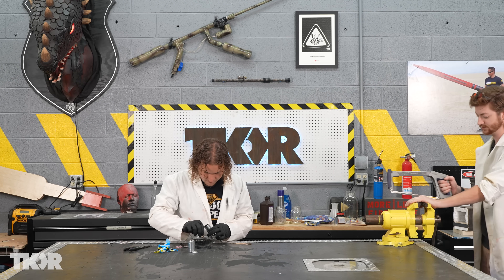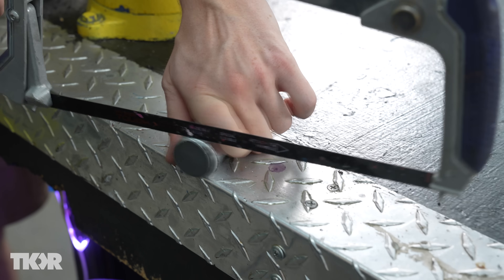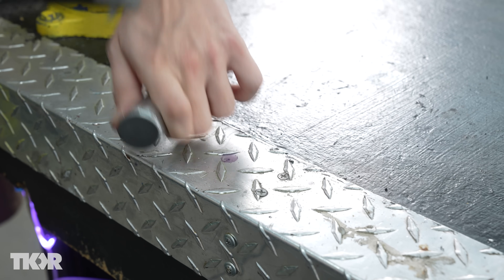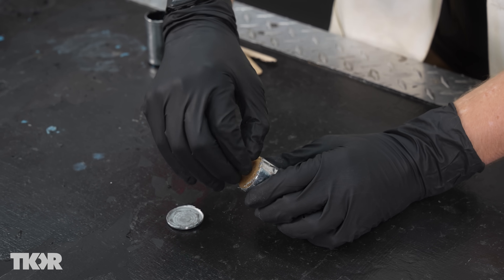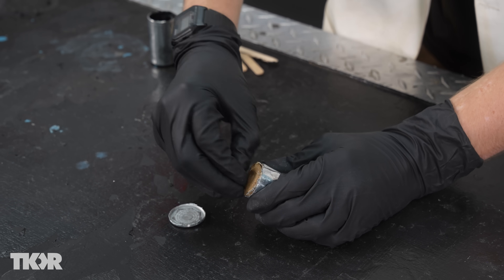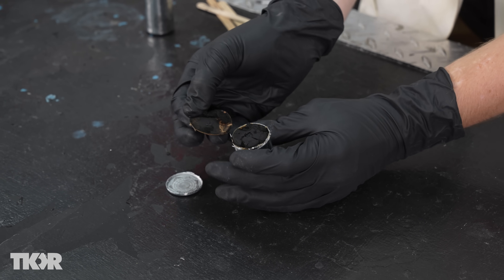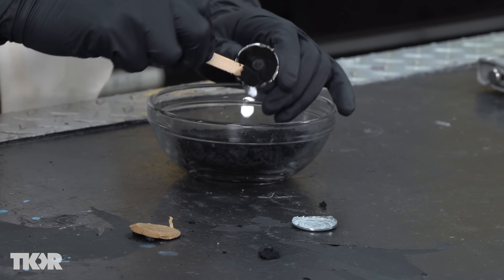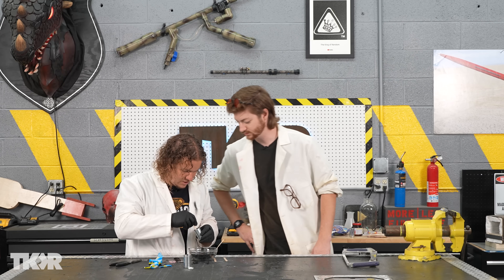I'm going to hack this one apart. The casing is pretty thin, so if you carefully go around with a hacksaw, you'll be able to cut through it pretty fast. We can just pull the top off — there'll be a paper cap under that, we can just rip that away. And there we have the manganese, we can just poke it out from the bottom.